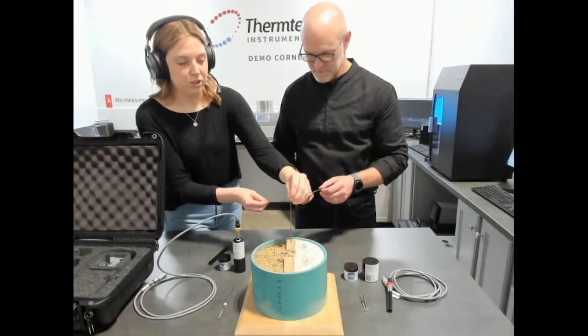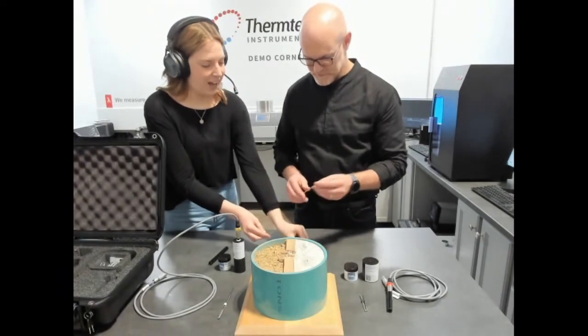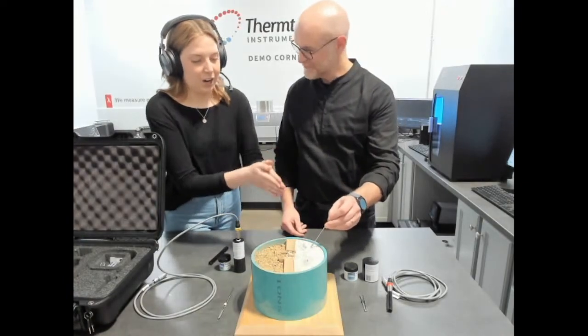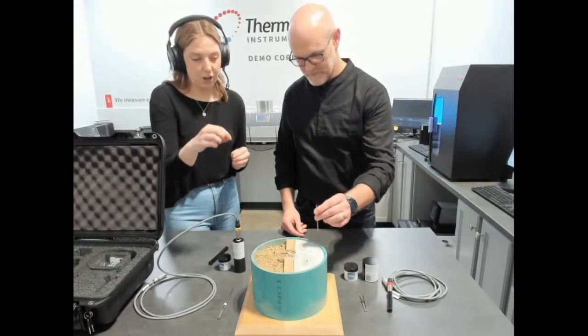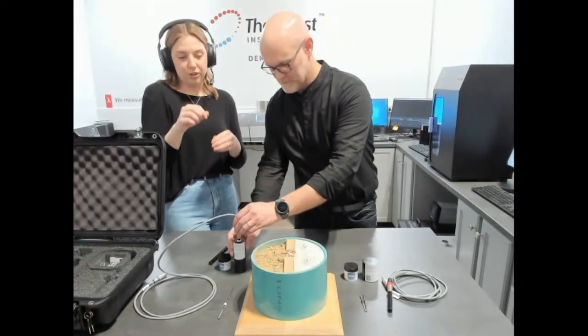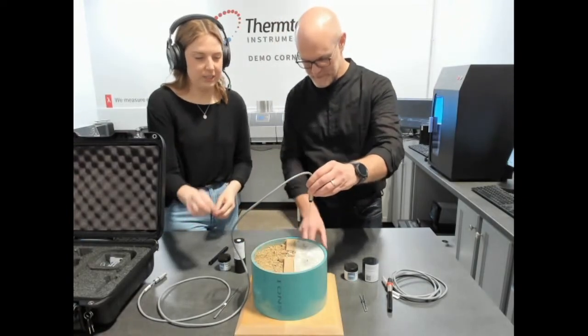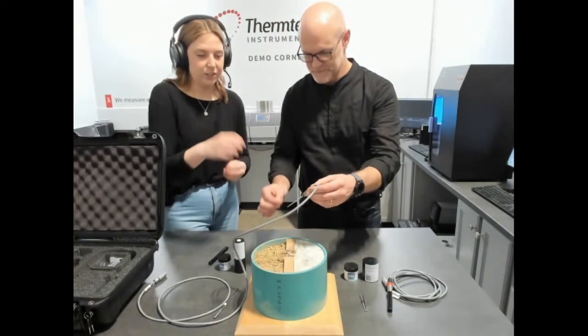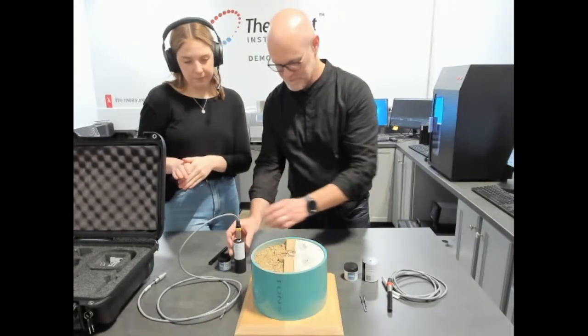For more rigid samples we also have this drill bit, which can be attached to drill a hole before inserting the needle. We also have our sleeve, which we can cast into concrete samples and then insert our needle with thermal paste to measure the concrete samples that way. We would just dip the needle in thermal paste, insert it into the sleeve, and that's how we measure concrete with the TLS 100.